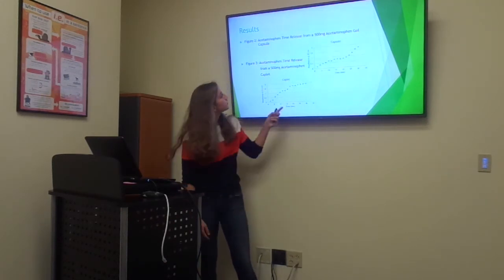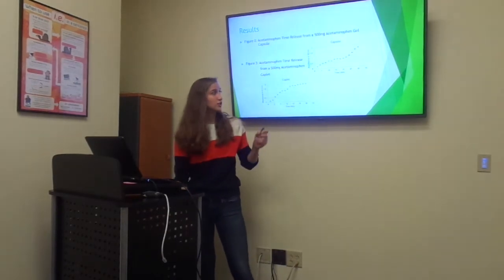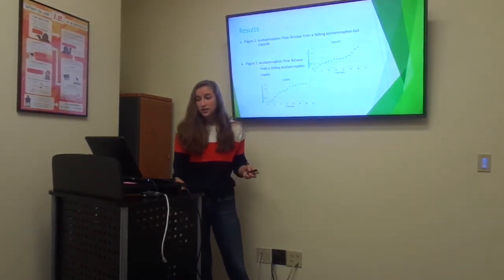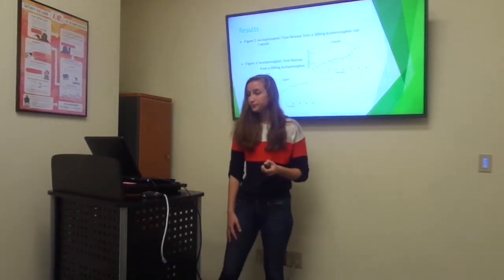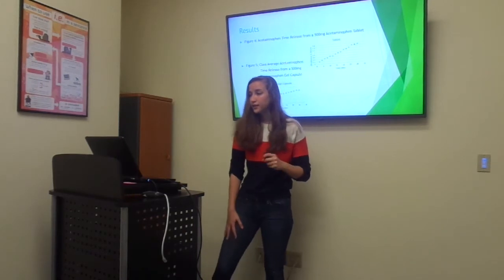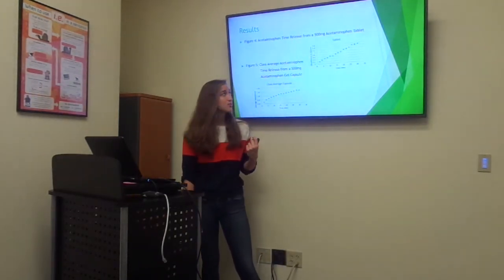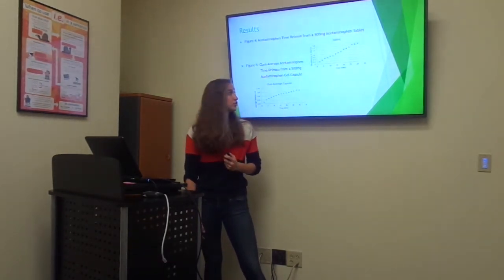So for figure 2, for the acetaminophen gel capsule, since there is no clear leveling off point, the last data point was used. For figure 3, every data point past 20 minutes was used as the leveling off point. For figure 4, for the acetaminophen time release of the tablet, the last 3 data points were used as the leveling off point, and for figure 5, it was the last 2.